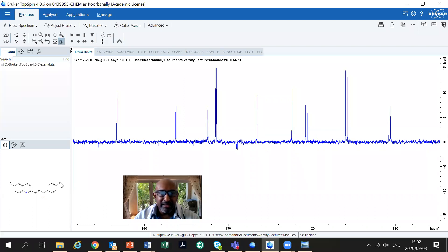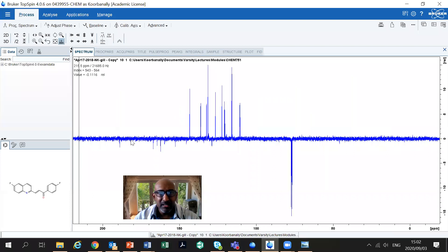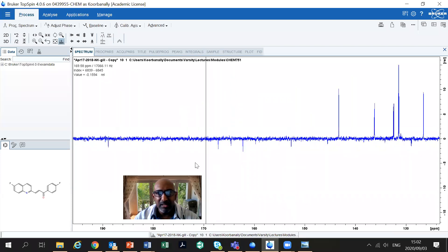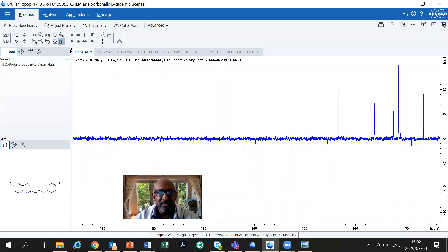Being NMR active, fluorine is going to couple the carbons directly bonded to it, and that carbon directly bonded to it is going to be coupled with a very large coupling constant of about 250 hertz. So that fluorine is going to couple this carbon with about 250 hertz.